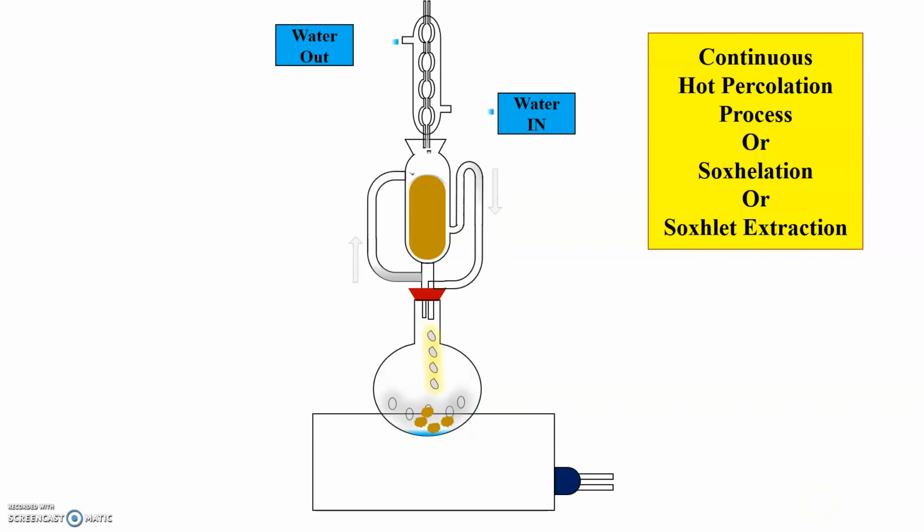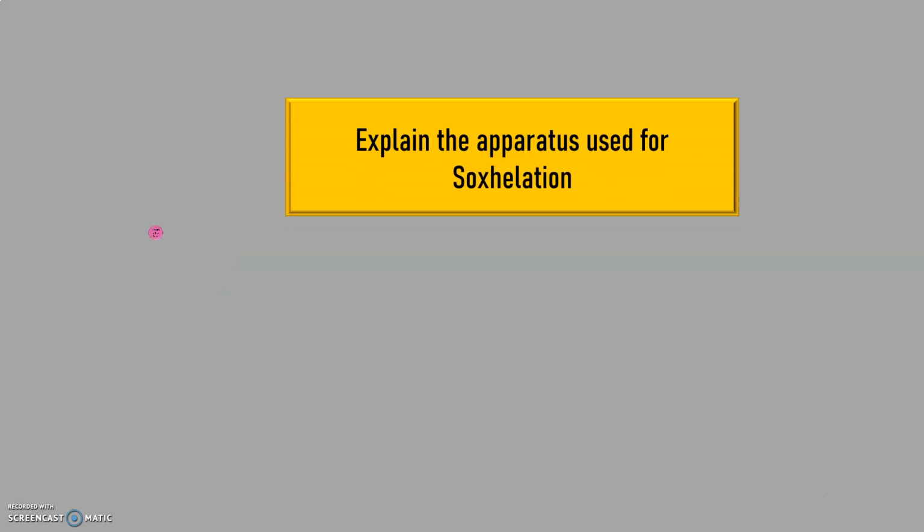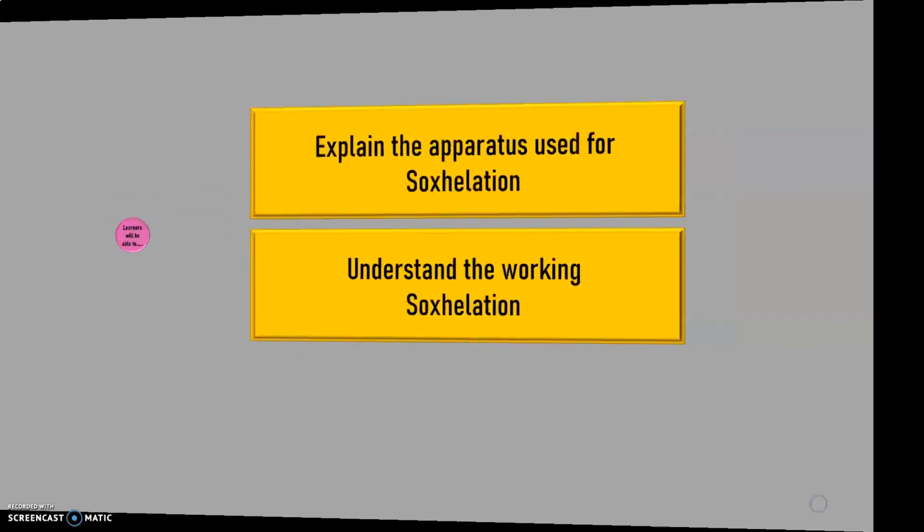So let us start with our presentation. After watching this video, the learners will be able to explain the apparatus used for soxhlation and understand the working of soxhlation.